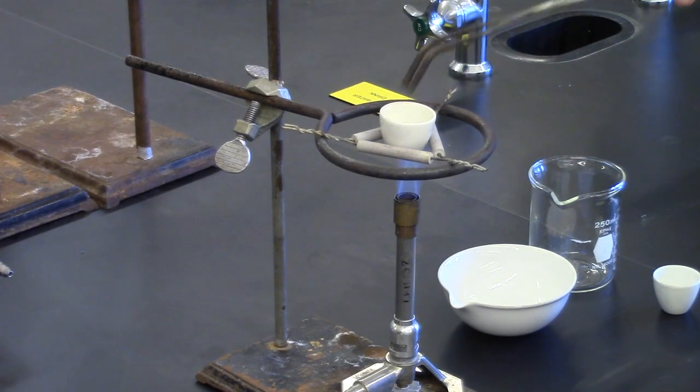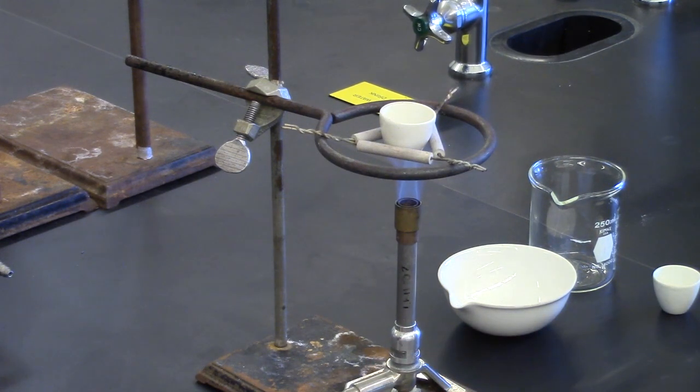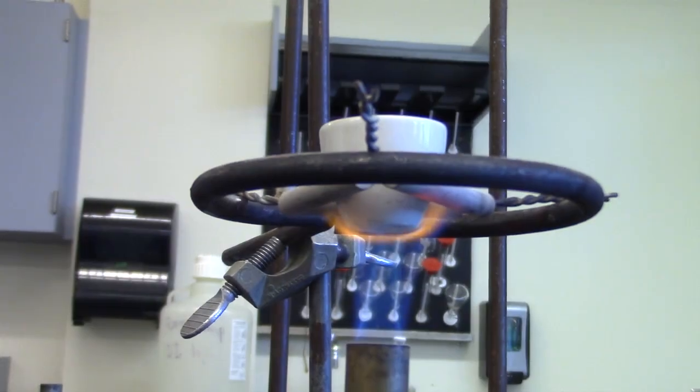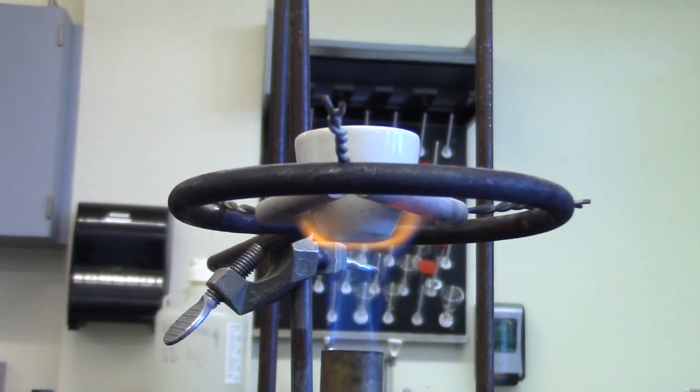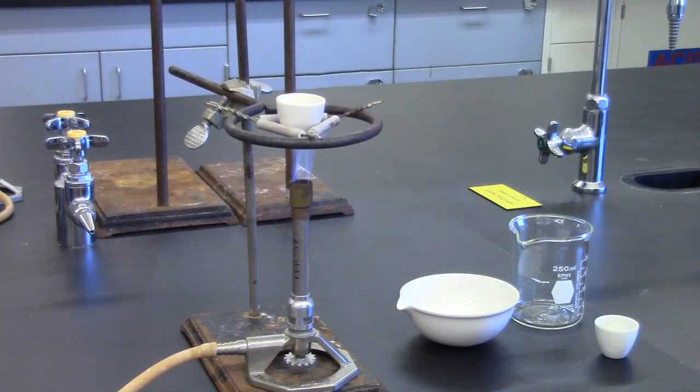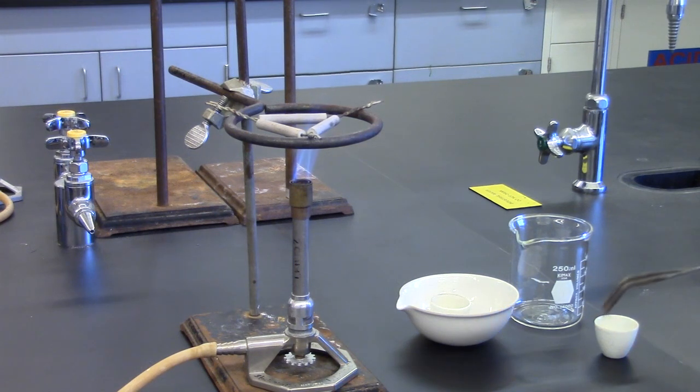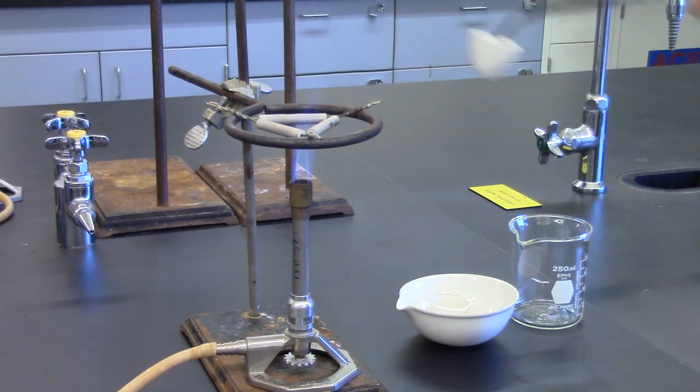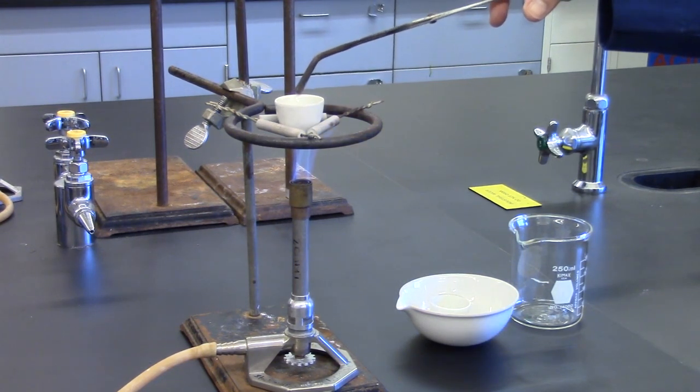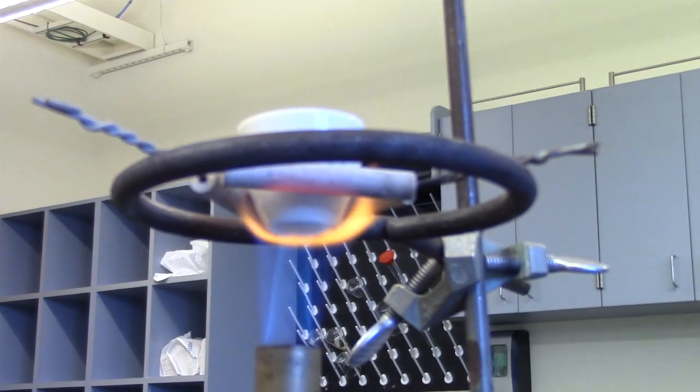Heat the crucibles one at a time at dull red for at least one minute, and cool in your evaporating dish or on your wire gauze. It will cool faster on the wire gauze.